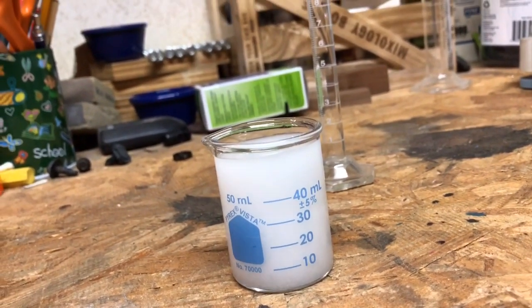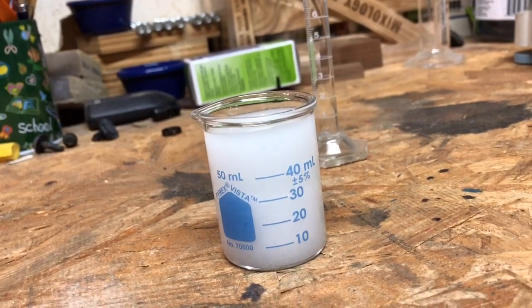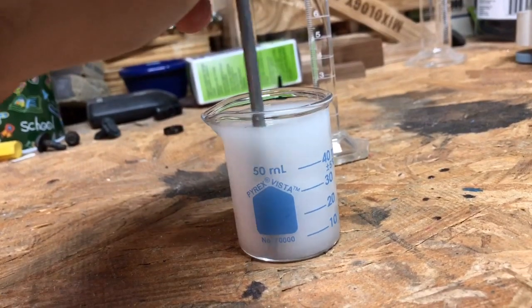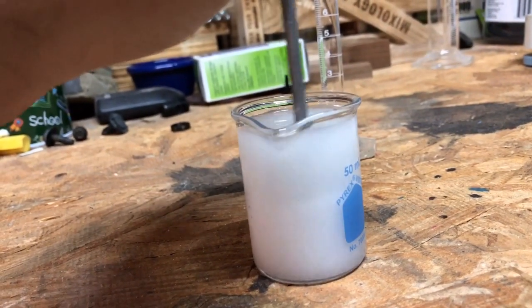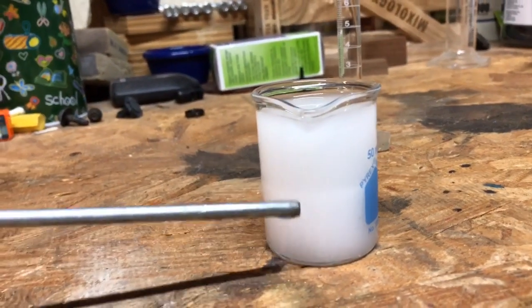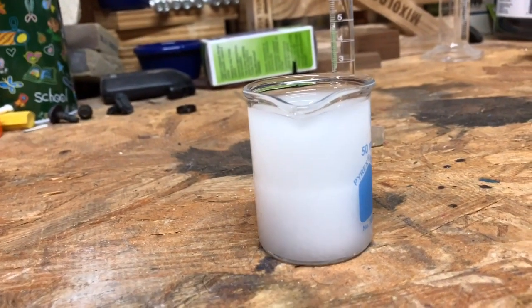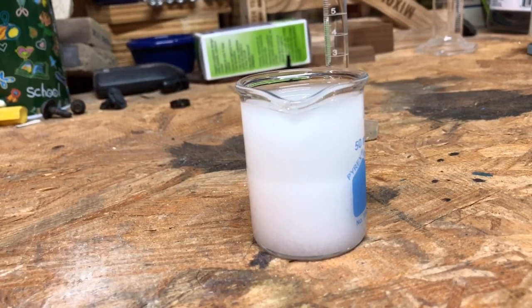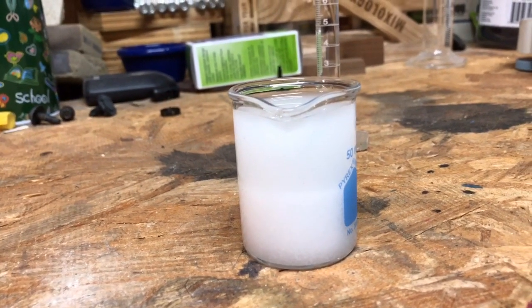Hopefully what I just did is add way too much. So let's see what we've got going on here. We'll make sure we stir this in and try and get as much to dissolve as possible. I can see we're starting to get a nice heavy layer sinking to the bottom, and we are going to just let this dissolve and settle to the bottom.